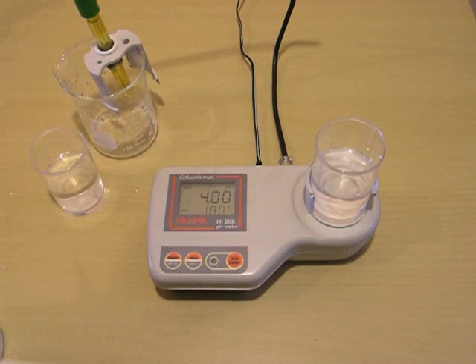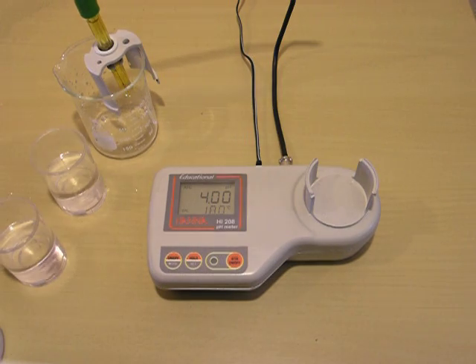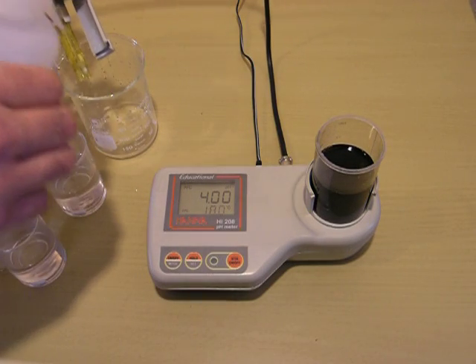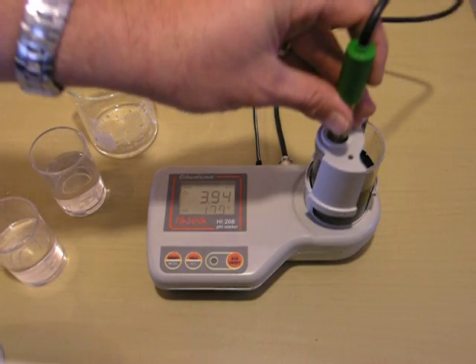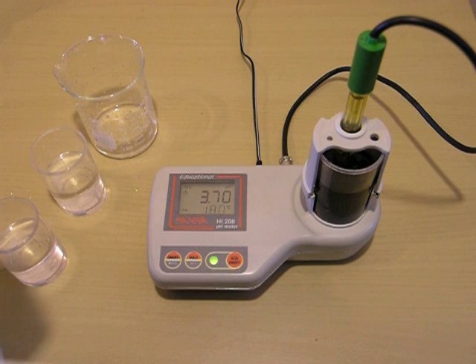Now, if you wanted to test a solution at this point, we would remove our buffer and either clean or use a clean beaker. Here I have one. Stir bar's in place. I'll again rinse my probe and replace it, then simply turn the stirrer on. I'm using deionized water to rinse my probe, so there should be minimal, if any, interference. Wait for your reading to stabilize. And that's how to use the HI208 pH meter for calibration and use.